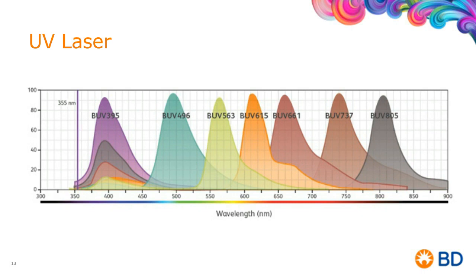And what's very interesting there is we can't always see them in the human because we can't do certain experiments with human. But in the work that Hervé and his team and I did on the mouse, we actually did a lot of different activation protocols. And the deck is going to show everyone the many different types of markers that actually move when there's an inflammatory response or an activation.